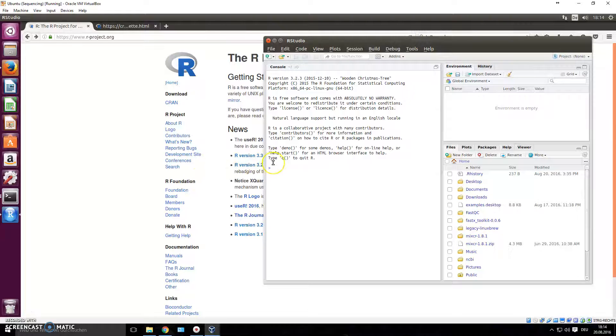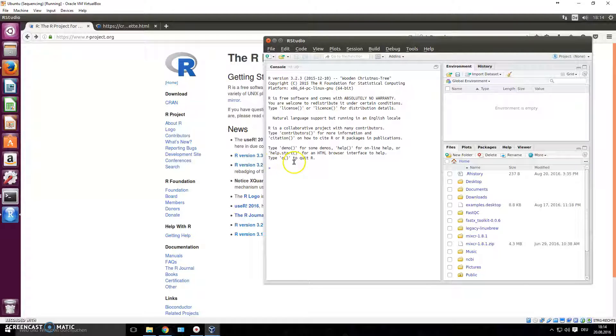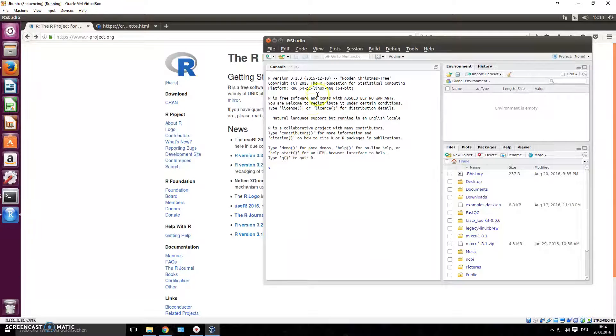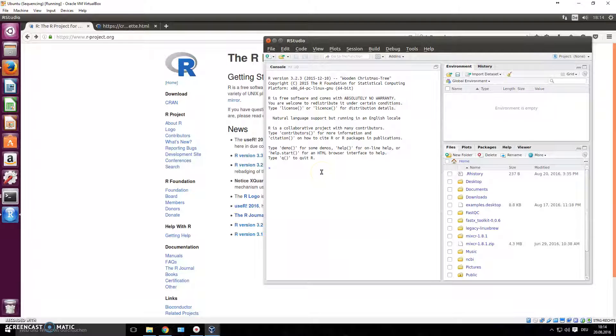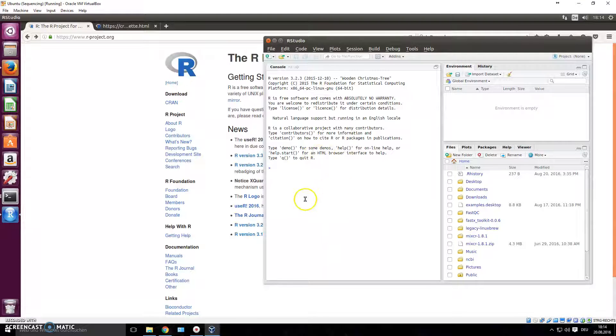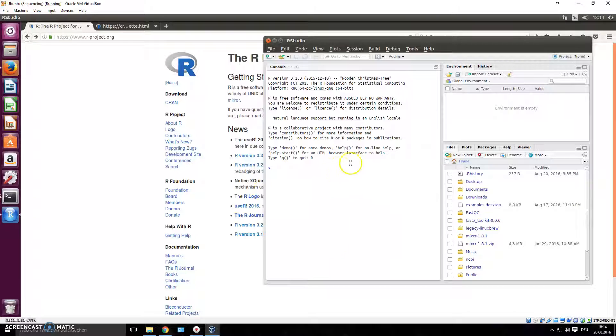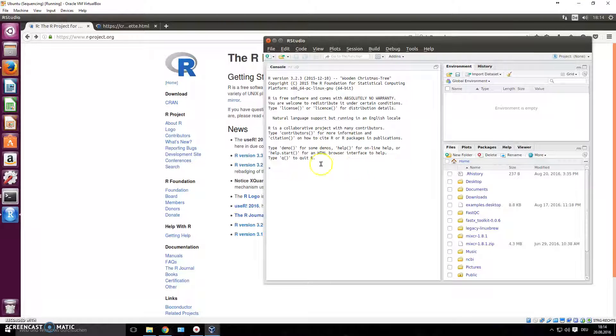Hey guys, welcome to another video on next generation sequencing data analysis. In the previous video we installed R and R Studio, and in this video we're going to install tcR. This is the name of an R package for analyzing immune cell sequencing data, specifically T cell receptor sequencing data and immunoglobulin sequencing data.